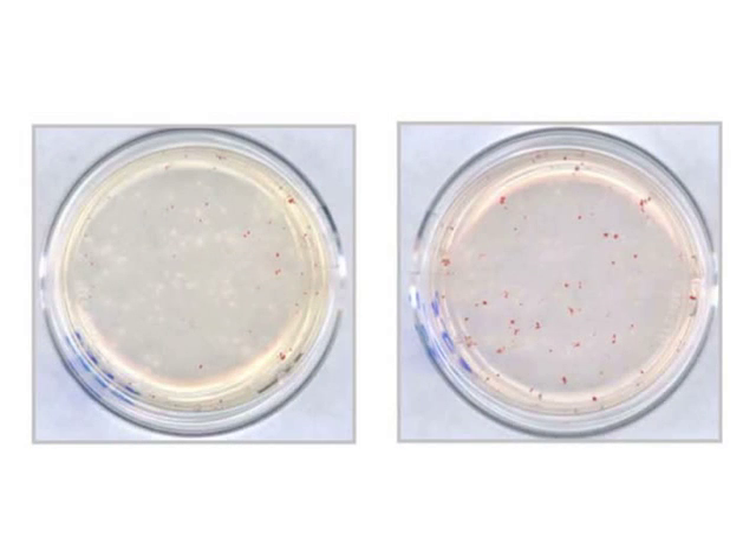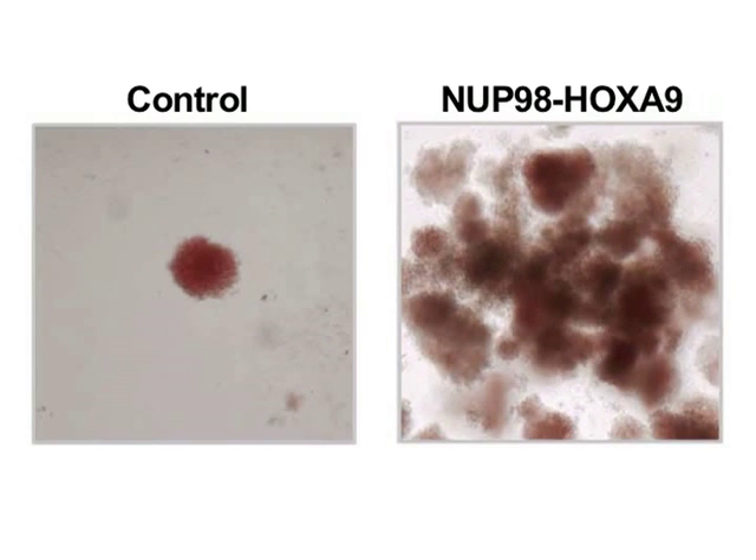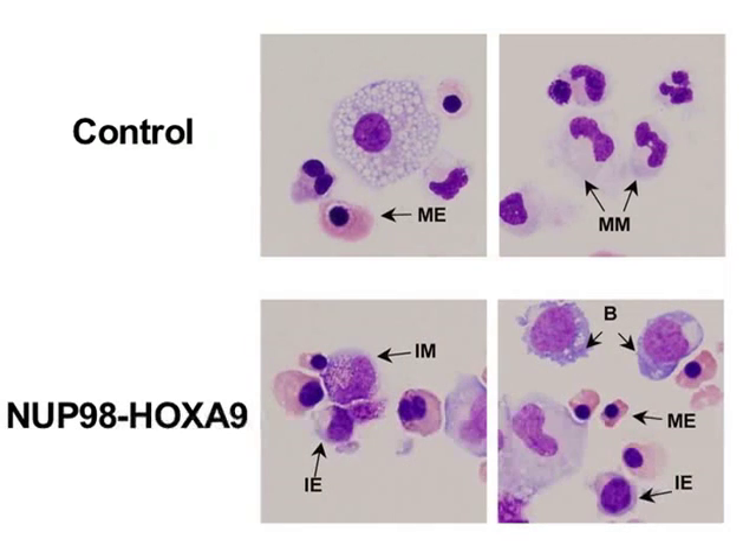For example, when compared to control, expression of the Nup98-HoxA9 oncogene increased the formation of red erythroid colonies. This marked impact of the oncogene is clearly evident when colonies are observed under low magnification. Further morphological examination by Wright-Giemsa staining provides information on the lineage and degree of maturation of the cell population. In this example, introduction of Nup98-HoxA9 caused an overall increase in the numbers of cells, with erythroid hyperplasia and inhibition of both erythroid and myeloid maturation.